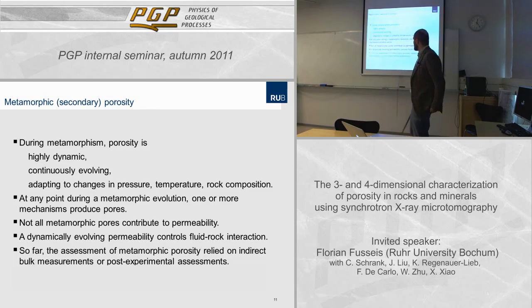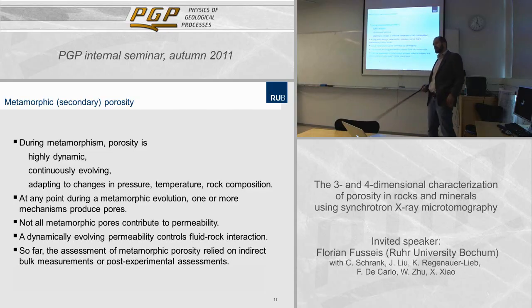Many of them were limited by the possibilities these researchers had to assess the processes that they were studying. So what they could do, and what is still being done, is either do an experiment where we measure a bulk property, any change in say how much fluid goes in, how much fluid goes out, and so on, or the strength of a particular rock body. However, we characterize the process on a continuum scale. We don't look at what's actually happening. The only way that we can do it is by a post-mortem assessment.